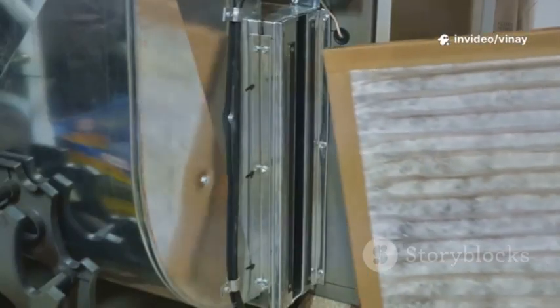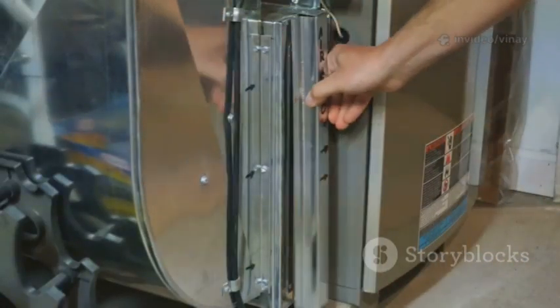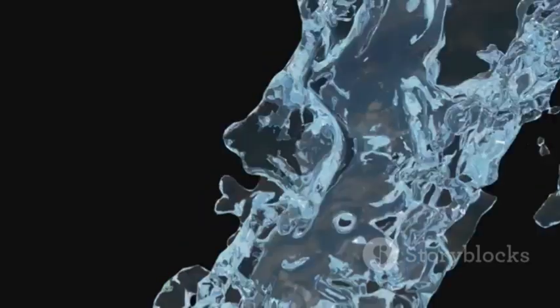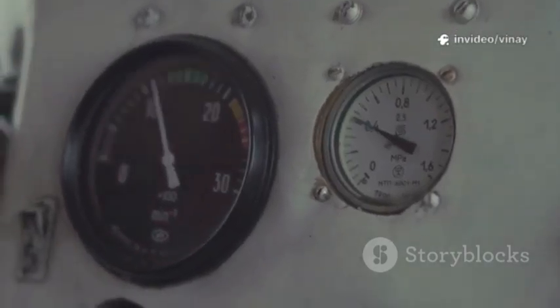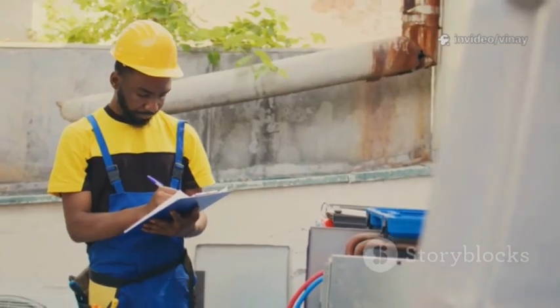The filter manufacturer provides a specification for the maximum allowable pressure drop for a given filter, test pressure, and upstream volume. The upstream volume, the space on the pressurized side of the filter, is really important here, since a larger volume will show a smaller pressure drop for the same amount of gas loss. If the measured pressure drop is greater than the manufacturer's specified limit, the test fails. A rapid or excessive pressure drop indicates that gas is escaping the system faster than it should by diffusion alone. This points to a leak in the system.